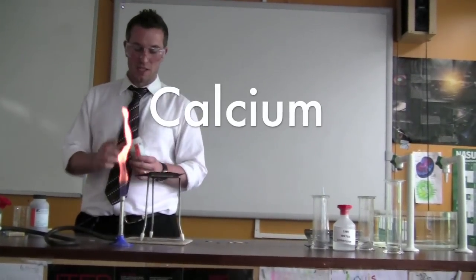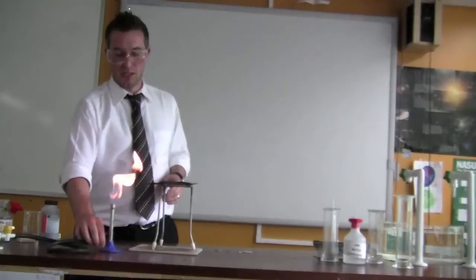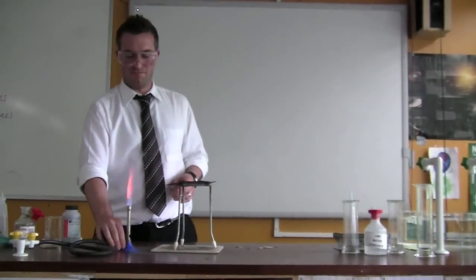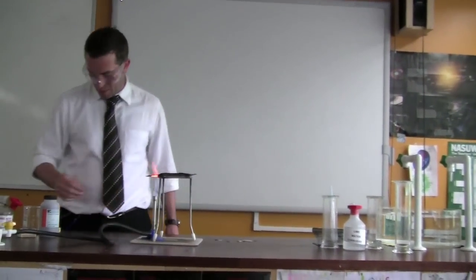Alright, calcium. Put a couple of pieces of calcium on the edge of this gauze. You're going to need your box burner set to roaring flame. Put it underneath and step back.